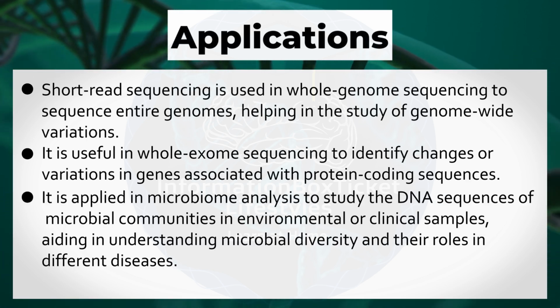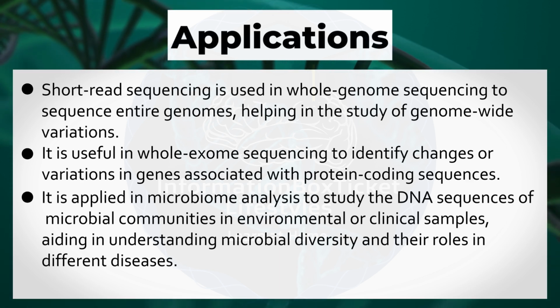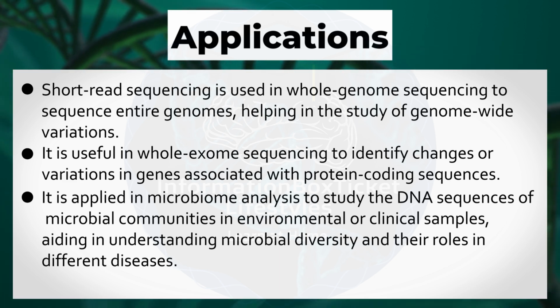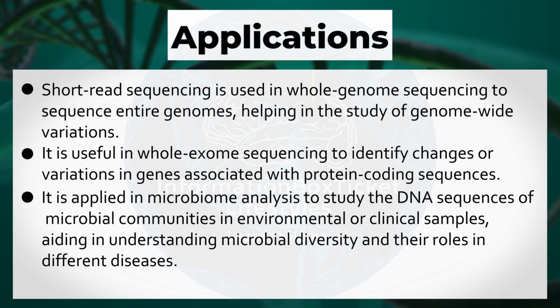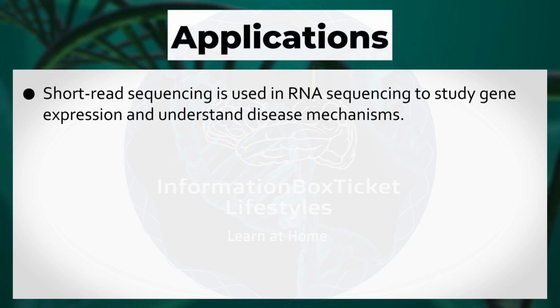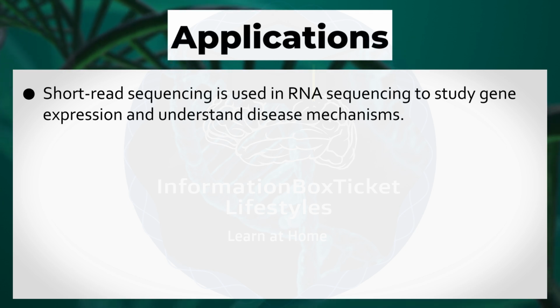It is applied in microbiome analysis to study the DNA sequences of microbial communities in environmental or clinical samples, aiding in understanding microbial diversity and their roles in different diseases. Short-read sequencing is used in RNA sequencing to study gene expression and understand disease mechanisms.